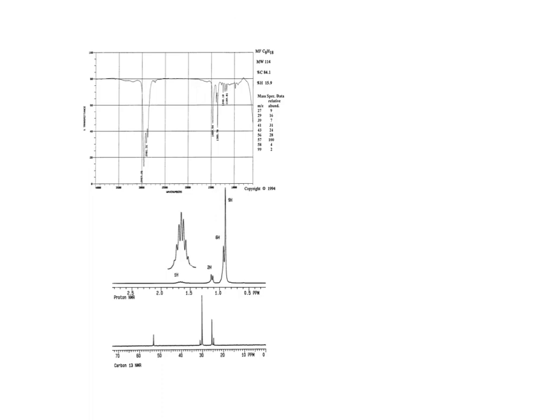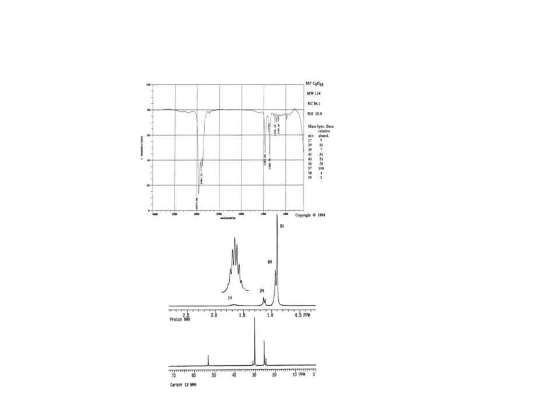All right, so note what we have given you here for each compound is the molecular formula, listed up top. We have given you the IR spectrum. Ideally you've watched all the videos dealing with IR spectroscopy as well as NMR spectroscopy, and you know that an IR spectrum is read as percent transmittance as a function of wave number. We've also given you probably the most important piece of information, the proton NMR spectrum, which is down here.